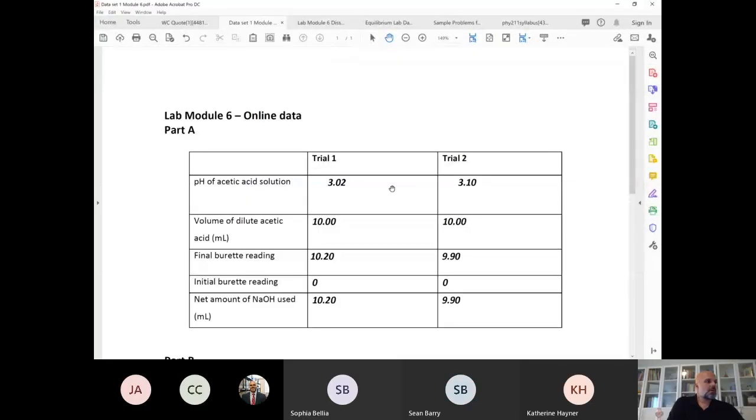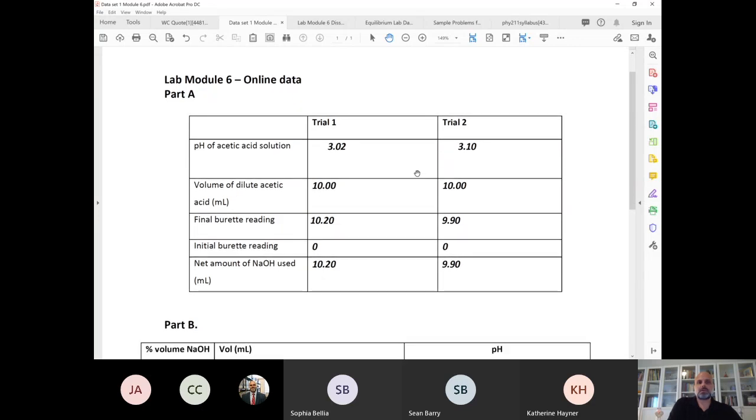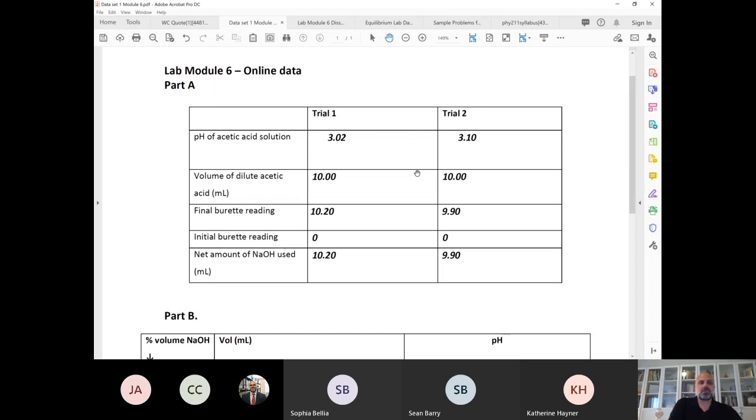So you're going to be given, and it's posted online, a set of data. You're obviously not able to go through and run all these reactions, but you're going to have a given set of data of one possibility of what you could have gotten, depending on working through this experiment. And you can see this is basically all the data that you would plug into your tables. And there are 4 different data sets, so we'll basically break it down and do it similar to last time. We just have 3 different teams' worth of data.